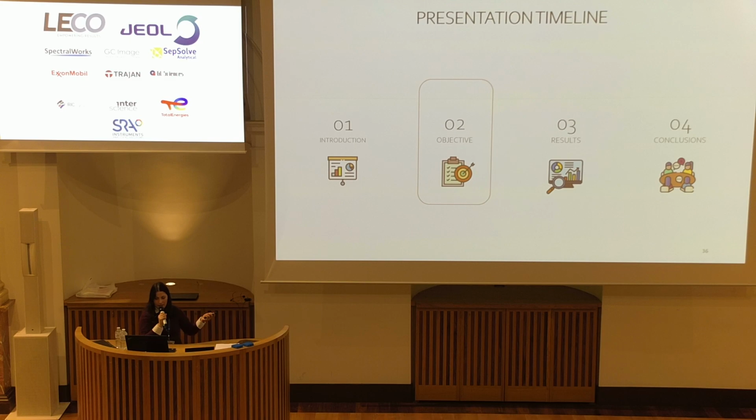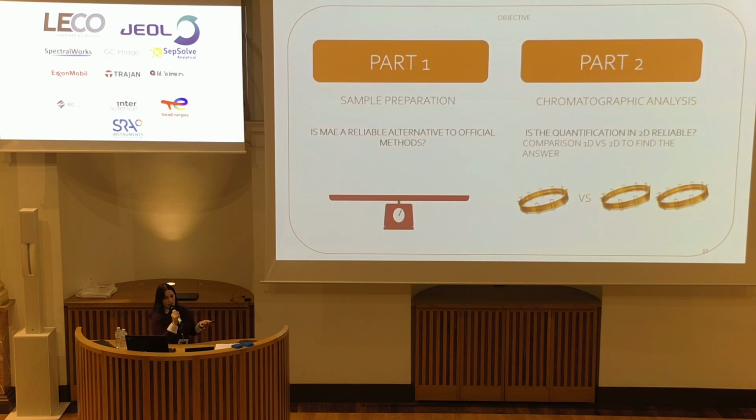So now, let's see the objectives of the work. There are 2 objectives. The first regards the sample preparation. So basically, we want to answer the question: is MAED a reliable alternative to official methods? And the second is about the chromatographic analysis. Often, person X comes to us and says, okay, I like what you do, but the quantification in 2D is not reliable. And so, to answer this question, with the comparison in 1D and 2D, we want to find the answer and say, we can do it.